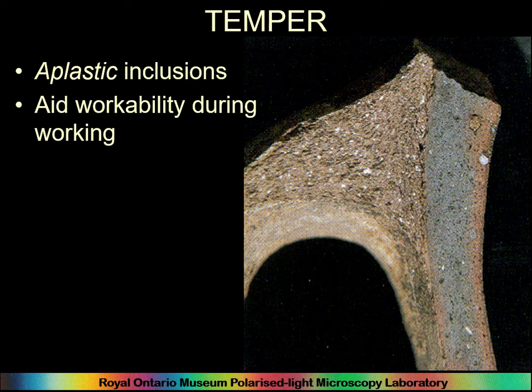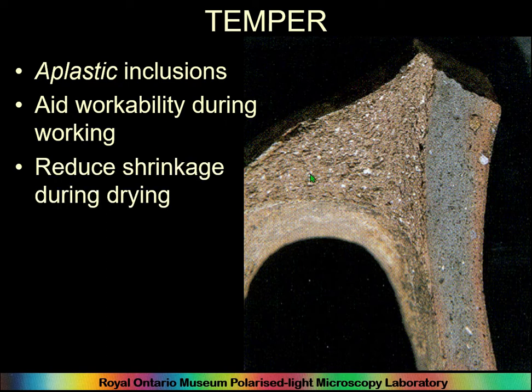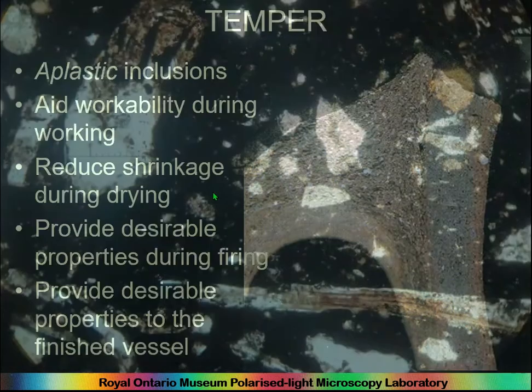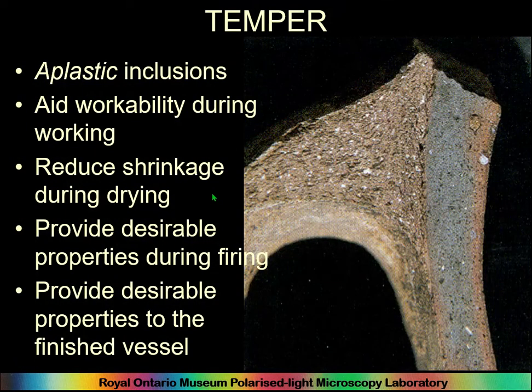I should fix that slide one day. They reduce the shrinkage during drying and provide desirable properties during the firing. And also provide desirable properties to the finished vessel.